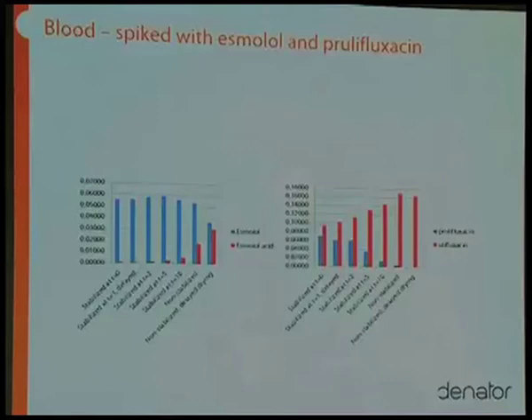The level stays roughly similar. The degradation fragment, the active molecule, slowly increases with time. And in the non-stabilized case, where we let it just dry at room temperature, the way this system is supposed to work, we see quite high levels of the degradation product.